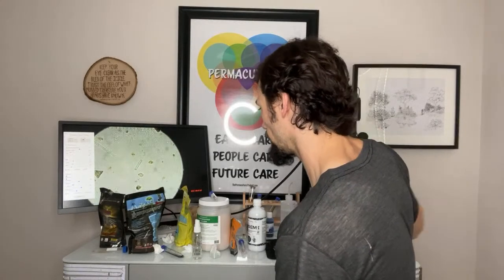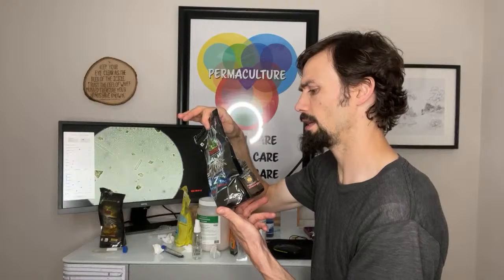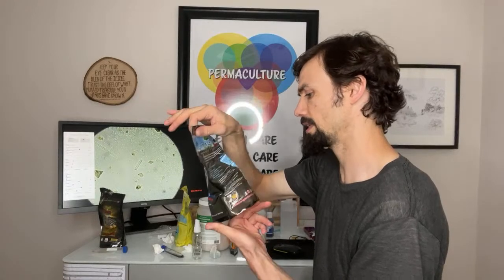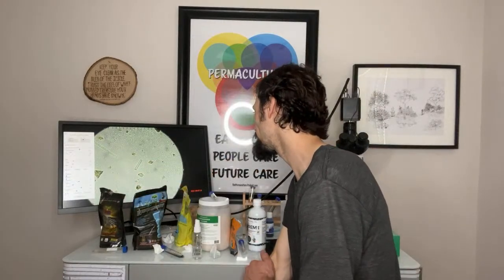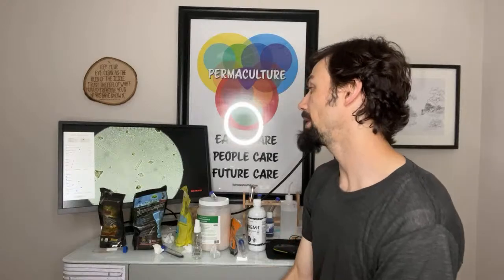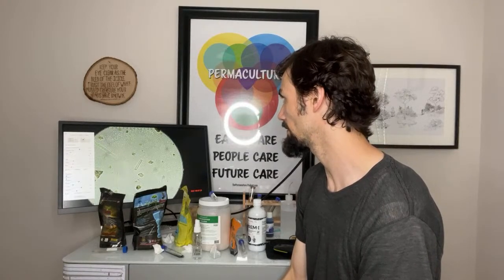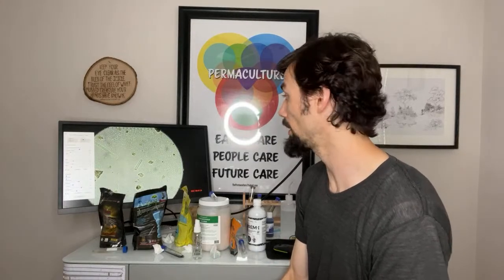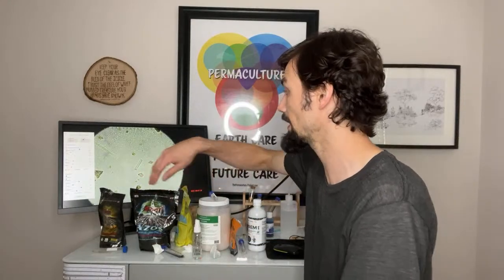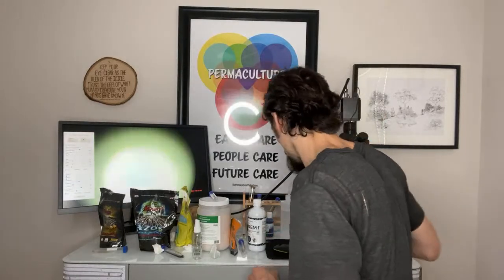They have other things in here other than just their pure bacteria. But it's pretty amazing to see basically the same size bacteria working on something. It's really remarkable actually. And that's how you can tell it's pretty darn pure. As an Azospirillum brasilense. All right, let's go back to the start and let's go to the next one.